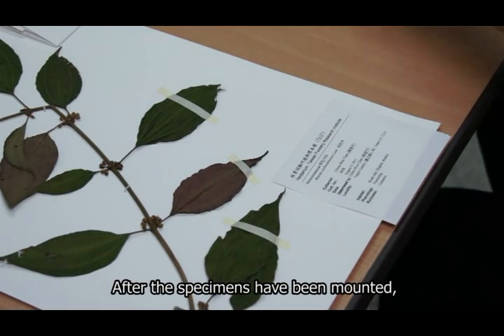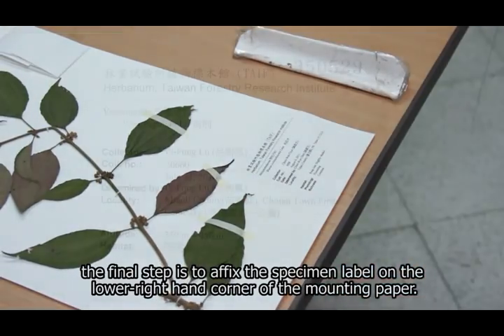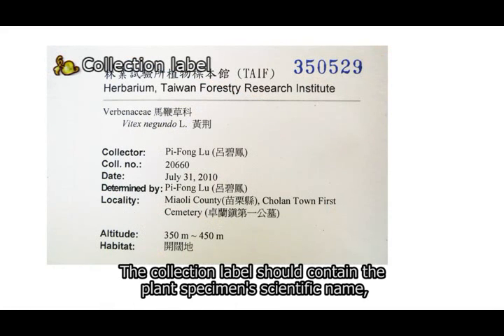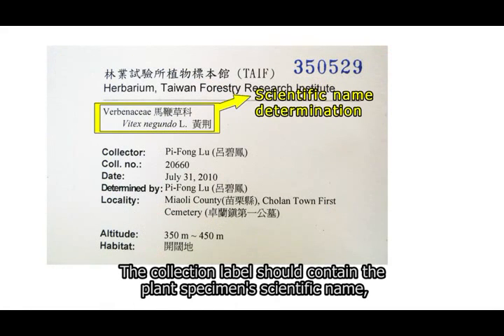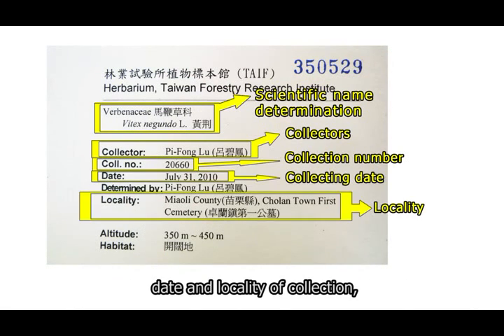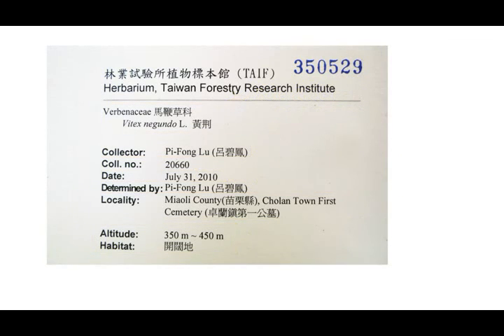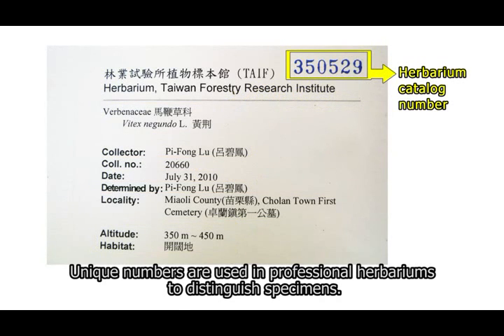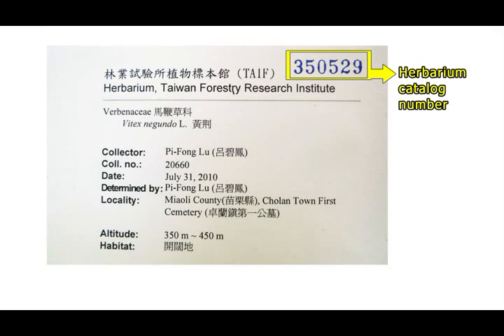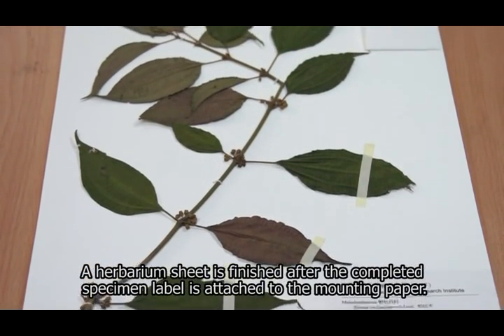After the specimens have been mounted, the final step is to affix the specimen label on the lower right-hand corner of the mounting paper. The collection label should contain the plant specimen's scientific name, the name of the collector, collection number, date and locality of collection, and other collection data such as habitat. Unique numbers are used in professional herbaria to distinguish specimens. A herbarium sheet is finished after the completed specimen label is attached to the mounting paper.